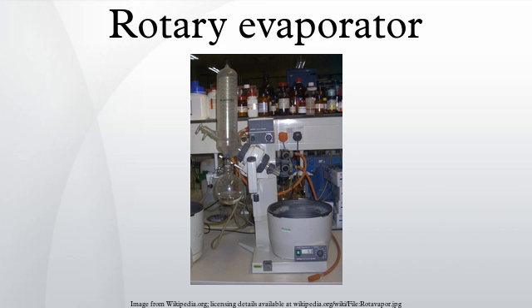However, careful application also allows removal of a solvent from a sample containing a liquid compound if there is minimal co-evaporation, and a sufficient difference in boiling points at the chosen temperature and reduced pressure. Solvents with higher boiling points such as water, dimethylformamide, or dimethyl sulfoxide can also be evaporated if the unit's vacuum system is capable of sufficiently low pressure.